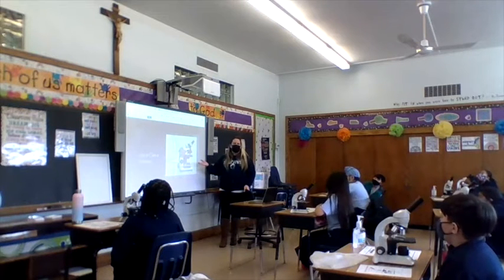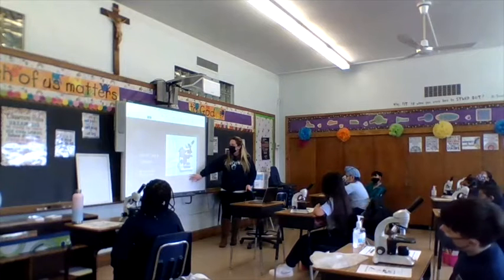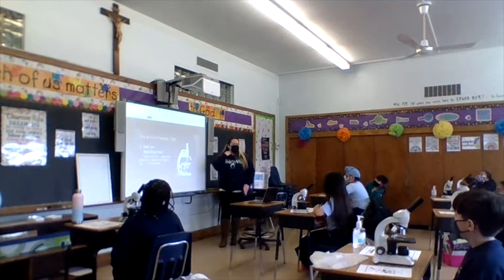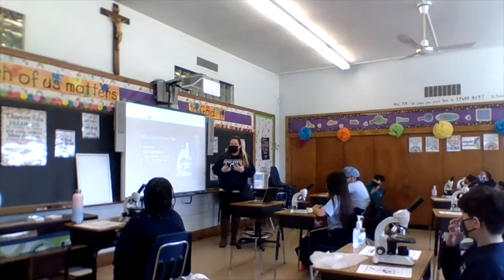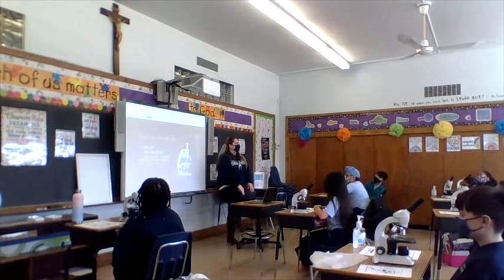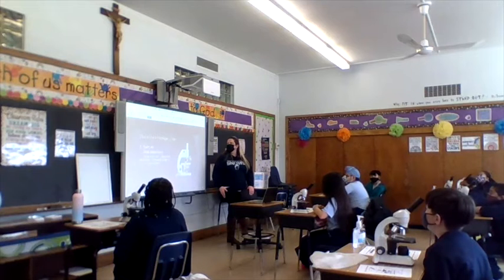Okay, we went over how to carry a microscope, so we're going to practice that when we put them back. So how we use it. Who can raise a quiet hand and read this? How would you start with looking at your slide? There are steps to do it. Ariana? Start on red objective.